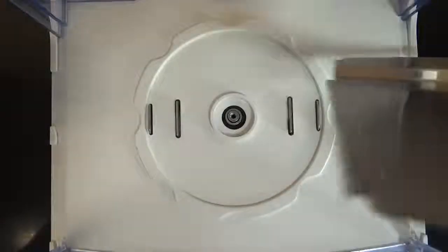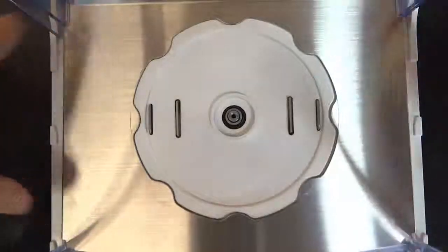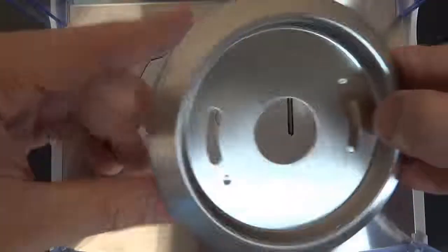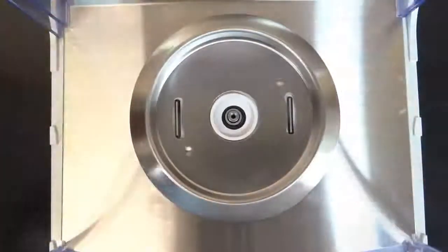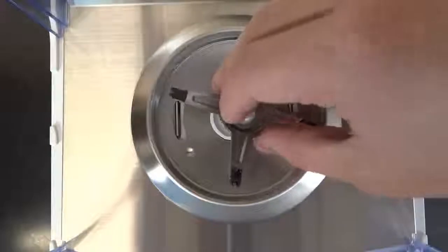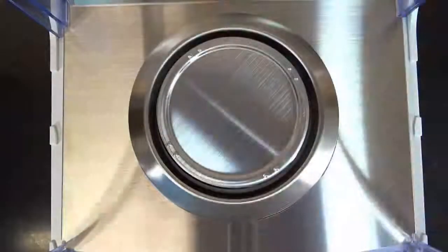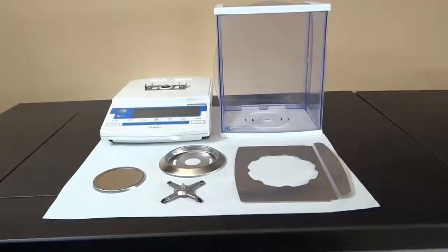The weighing chamber's floor is lined with stainless steel and fitted with a spill ring to prevent contamination from entering the housing, an anti-buoyancy plate to prevent air currents from interfering with the weighing results, and a 3.1-inch diameter platter. Each piece can be quickly removed, making cleaning easy.